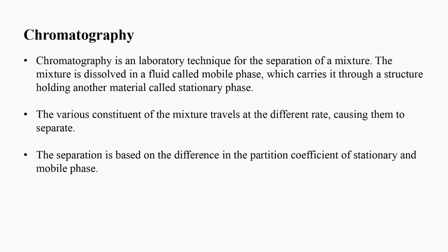Chromatography. Chromatography is a laboratory technique for the separation of a mixture. The mixture is dissolved in a fluid called mobile phase, which carries it through a structure holding another material called stationary phase. The various constituents of the mixture travel at different rates, causing them to separate. The separation is based on the difference in the partition coefficient of stationary and mobile phase.